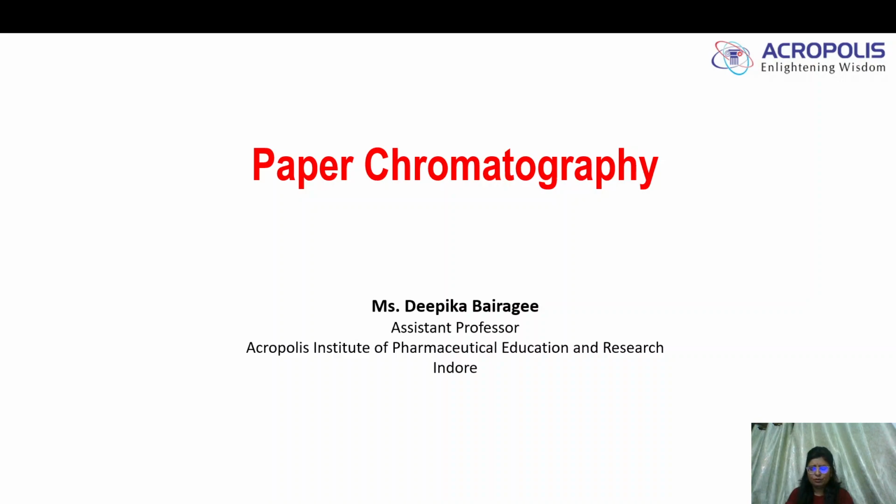mobile phase. So basically the term chromatography comes from the Greek word chroma, which means color, and graph, which means to write. So in a chromatogram, as you can see, we achieve colored spots. Recently the IUPAC has defined chromatography as a method used primarily for the separation of the components of a sample, in which the components are distributed between two phases. As I have already discussed, one phase is the stationary phase while the other is the mobile phase.